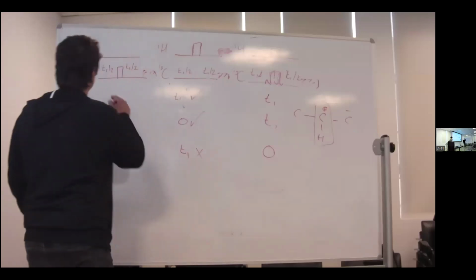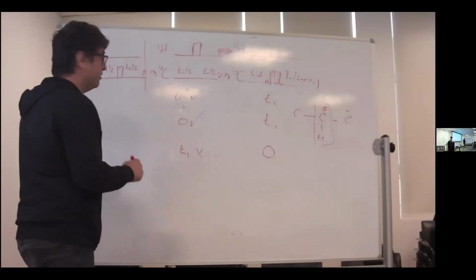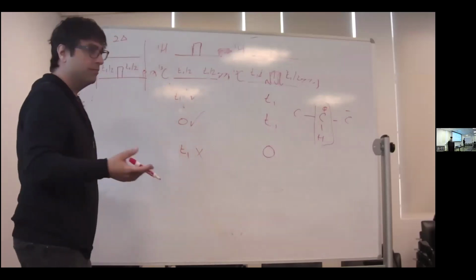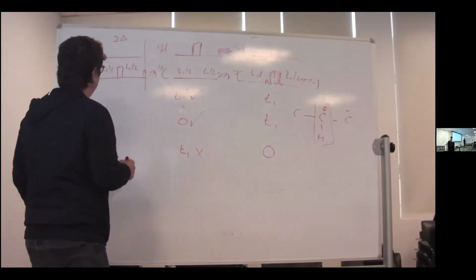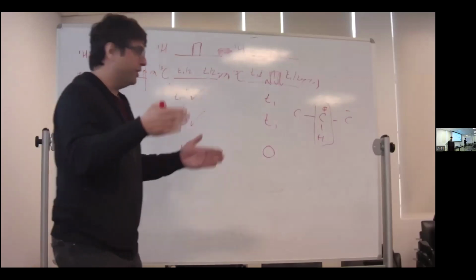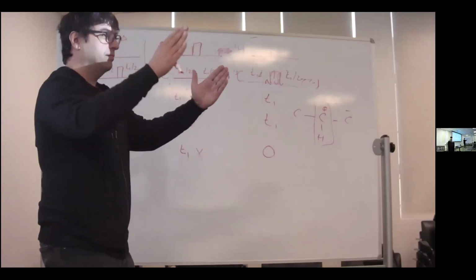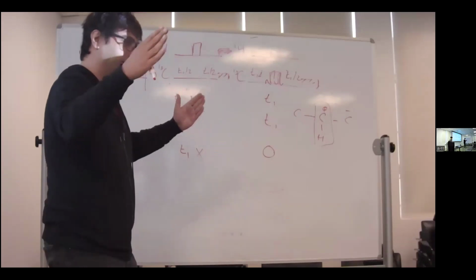Now let's imagine we come up with a difference. We decide, you know what we're going to do? We're going to have a constant time period. We're going to call that constant time period 2 delta. Delta is a delay which we can choose. It's under our control. And then I am committed to this delay for the indirect evolution. I am not allowed, as in the normal HSQC experiment, to grow the time over time, just at a longer time period.